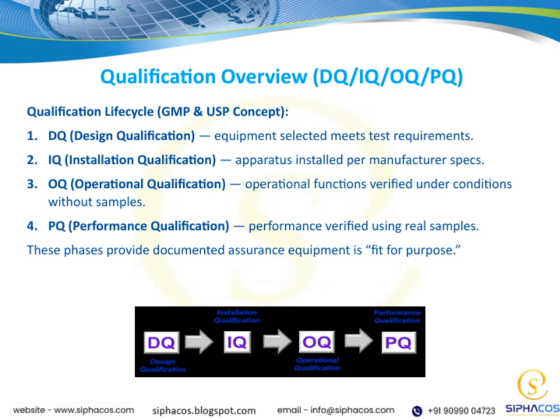Starting with design qualification, or DQ. This is where we confirm that the equipment we've selected actually meets all the necessary test requirements. It's about making sure the design aligns with our needs before moving forward.